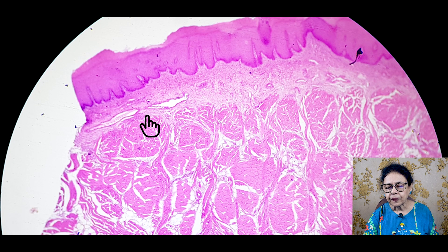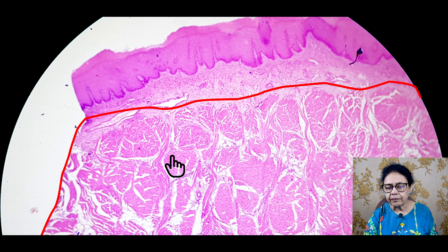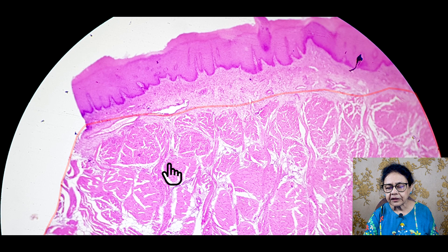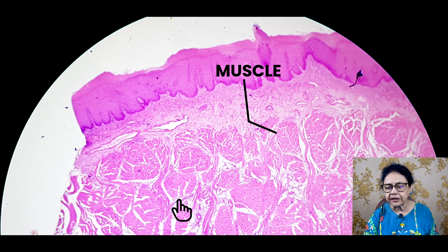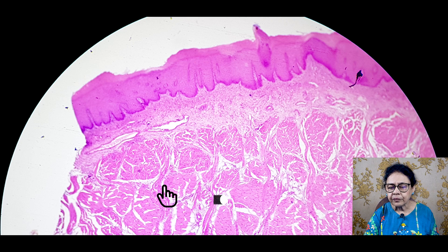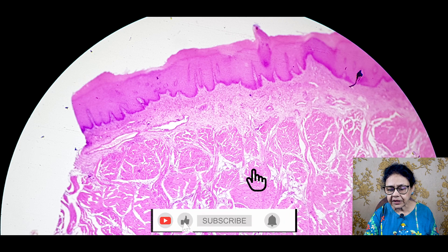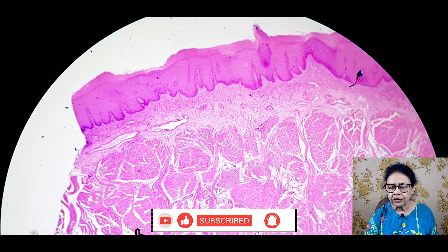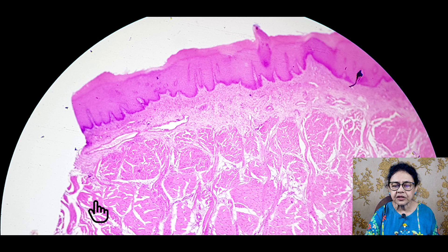Then you will see that there are muscles. You see the muscle layer — they are in different layers, but they are in a haphazard direction. You will see our tongue is a muscular organ. So it is lined by stratified squamous epithelium, and below that you will get muscle. You will see different types of muscle. So you will identify this is the tongue.